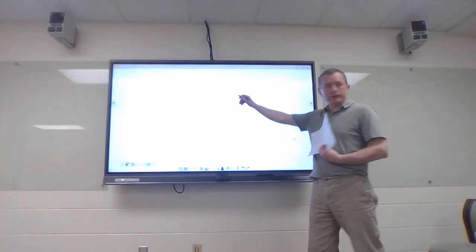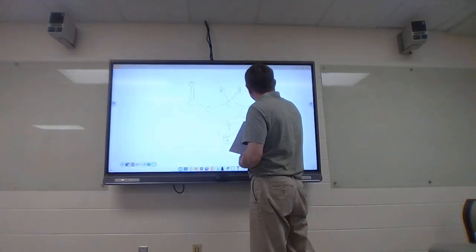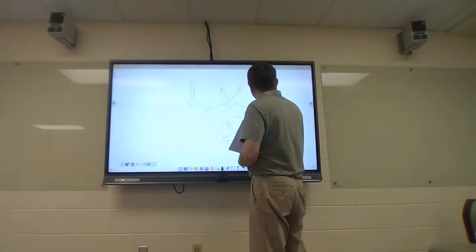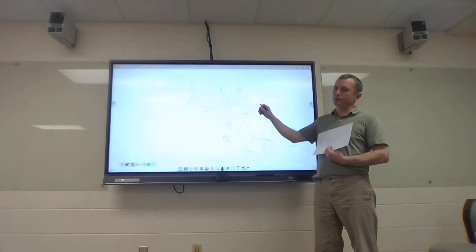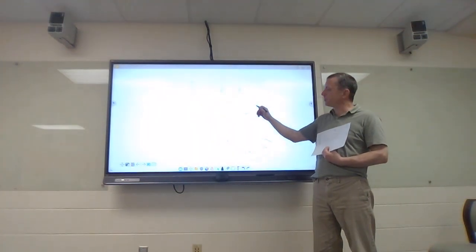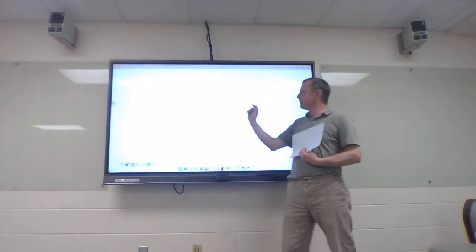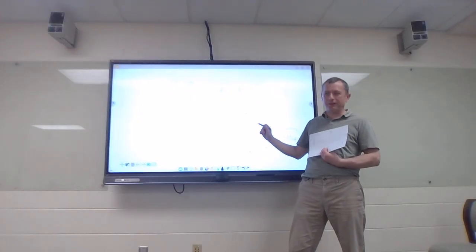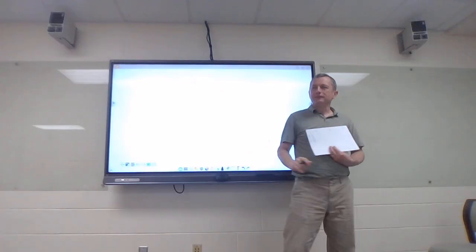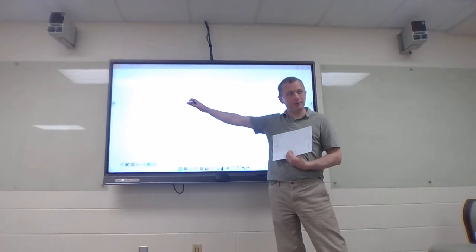But okay, in this case, there's my CH2. Now to get to my pattern of CH2, CH3, to get my quartet triplet pattern again, here's this one, also up there again, right around 1. That doesn't change much. All I've changed is what's pulling electrons away, but that doesn't really shift this one much. You notice that? Look through all those examples. You can see that this part doesn't move that much. I'm just changing what I threw out here. So this is actually very similar to ethanol, except now with that carbonyl there.